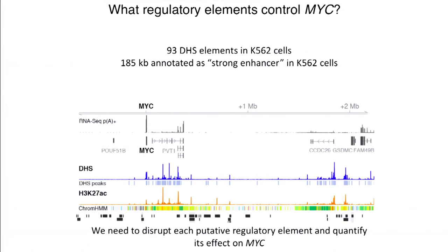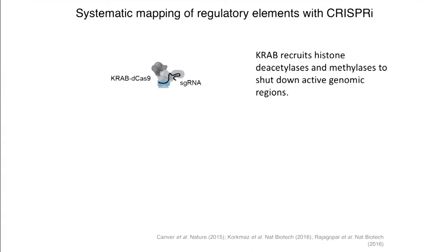And this would be very challenging to do in an arrayed setting. This would be quite a lot of wells in a 96-well plate, quite a lot of time for me. And so we are using a pooled screening approach.